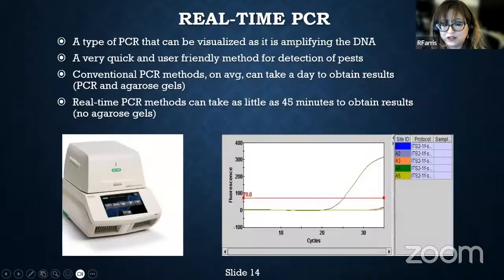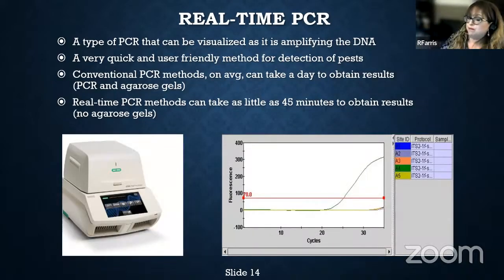So real-time PCR, it's another type of PCR. It's different from conventional. As I mentioned prior, when you're developing your PCR, there are several components that you put in your PCR reaction in order for it to amplify. One of the components you put in there are what we call primers. Those primers hone in to specific regions of your target DNA and they amplify those regions.